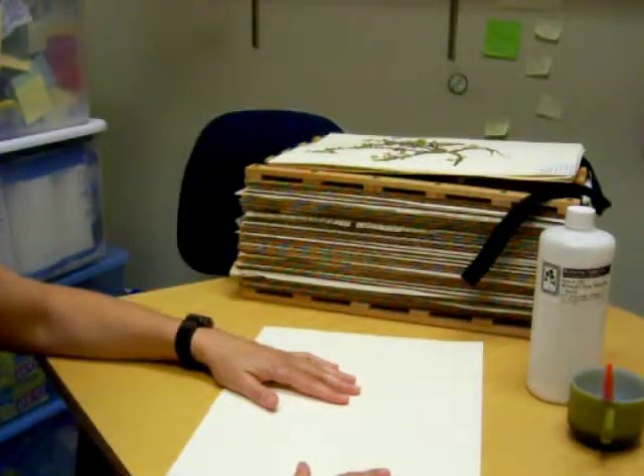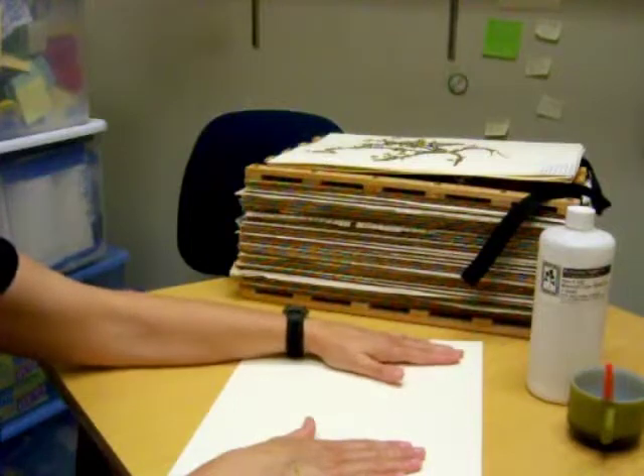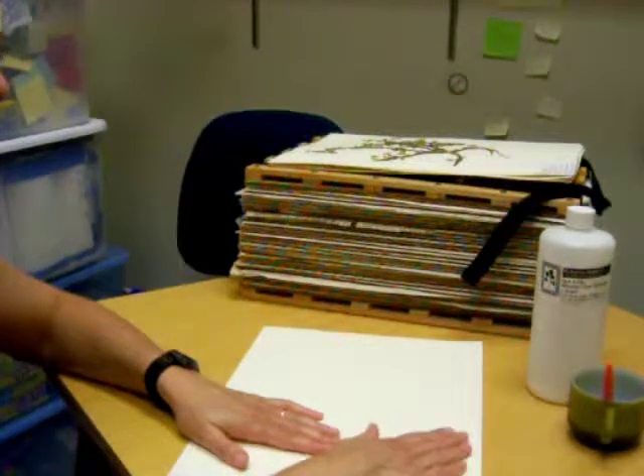Allow them to dry. You may want to weight them down very gently with a heavy book just so that all parts of the plant, if it tends to warp a little bit, are in contact with the glue and the paper. And once you're done, you'll have a plant collection to turn in.